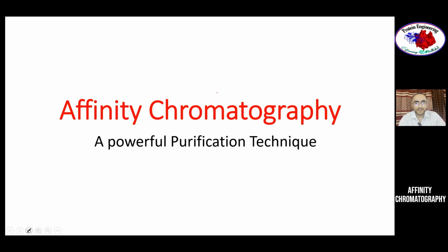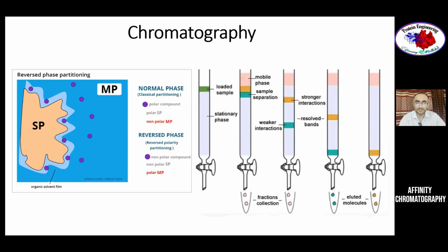Hello everyone. In today's lecture, we will talk about affinity chromatography. That's a very powerful technique for purification of analytes, including biomolecules. In an earlier lecture, we discussed the basic principle of chromatography, and we understand that in a chromatographic system, you must have a stationary phase and a mobile phase.